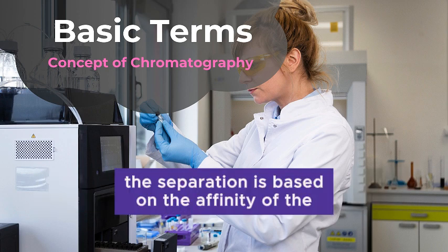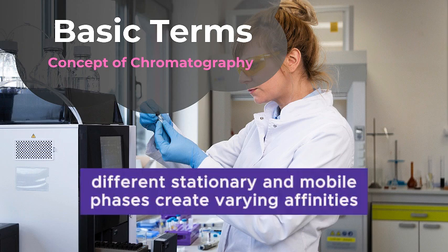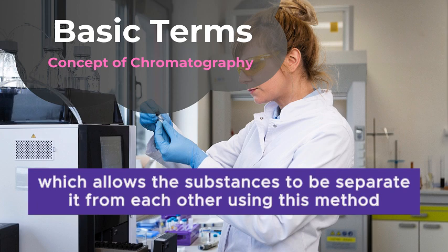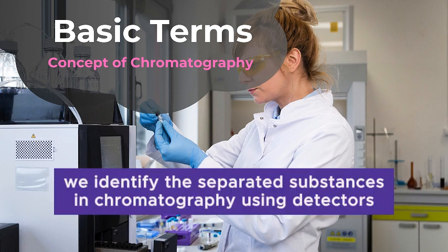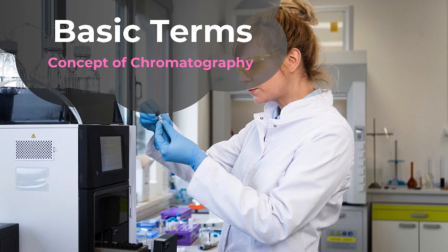The separation is based on the affinity of the substances for the stationary phase and the mobile phase. Different stationary and mobile phases create varying affinities, which allows the substances to be separated from each other using this method. Subsequently, we identify the separated substances in chromatography using detectors. Therefore, chromatography is a method for the separation and quantification of samples.